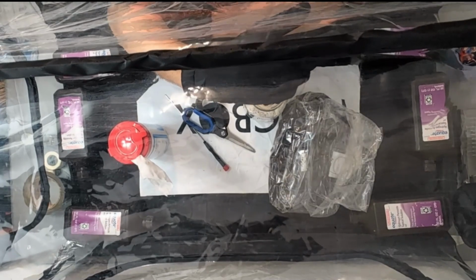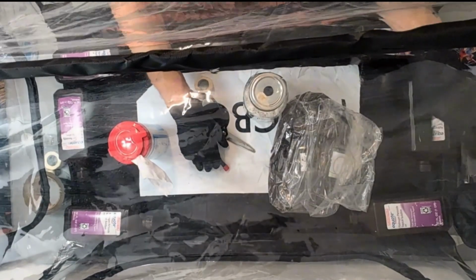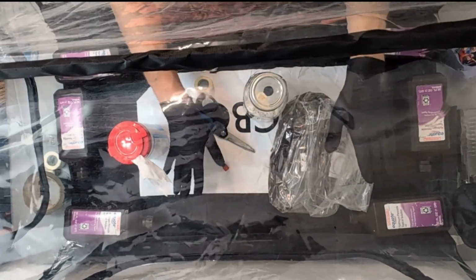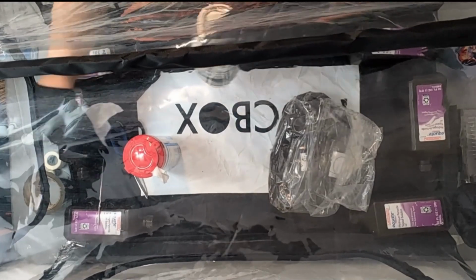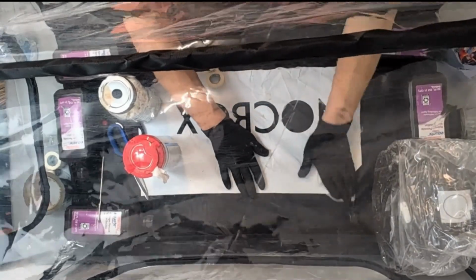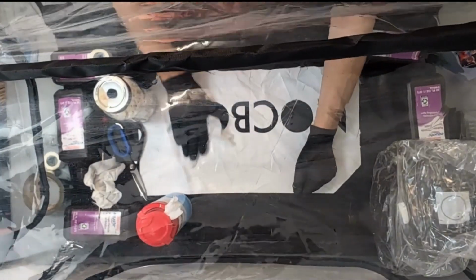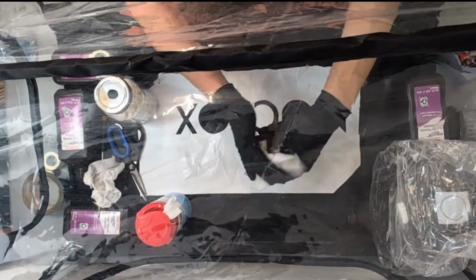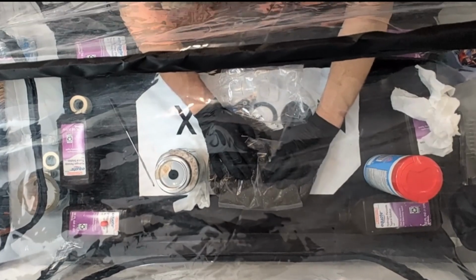If you are curious why I have so many bottles of peroxide in here, it's because this still air box is extremely light, so I just wanted to put them in here to help weigh it down onto the table. I will be sanitizing all of the things I'm going to be working on and with. The first thing I'm going to do is wipe the bottom of the box. You really want to make sure you get the inside of the still air box as sanitized as you're able to. The whole point of the still air box is to reduce contamination. Okay, I think I got all my equipment sanitized enough.